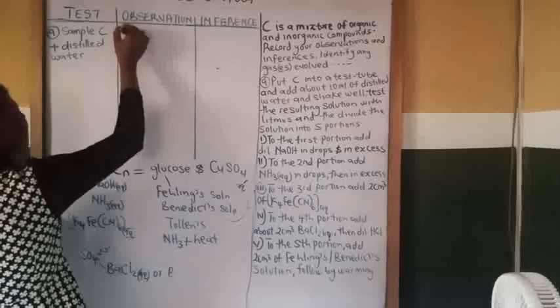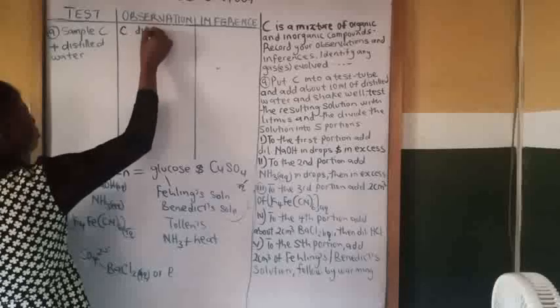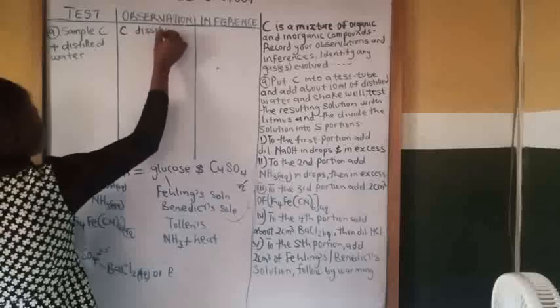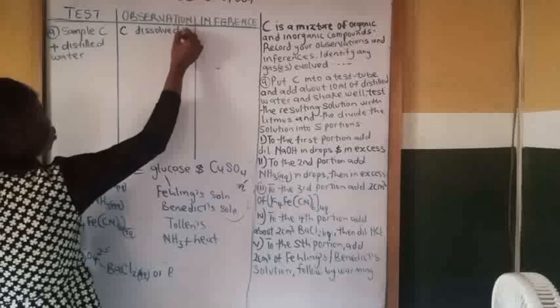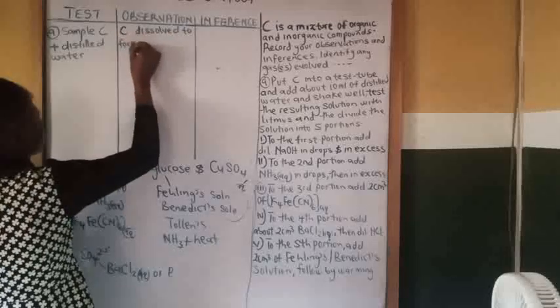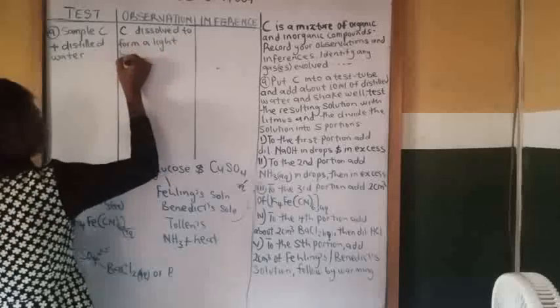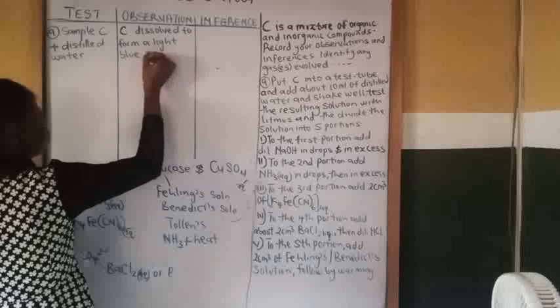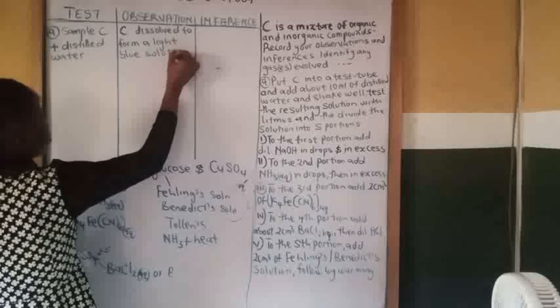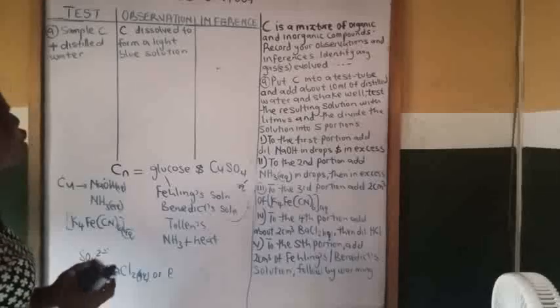So we are going to say: C dissolved to form a light blue solution.